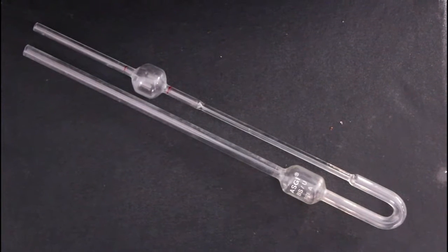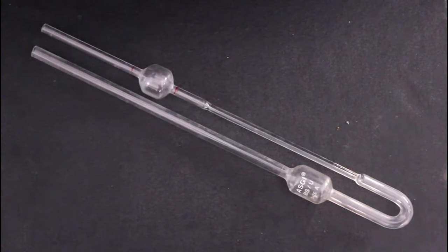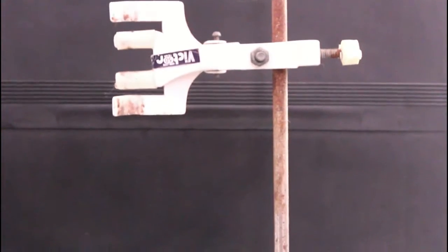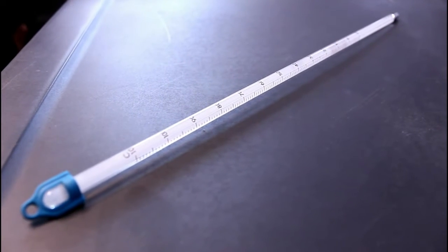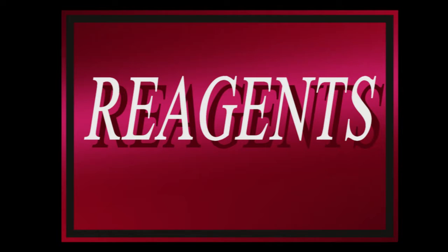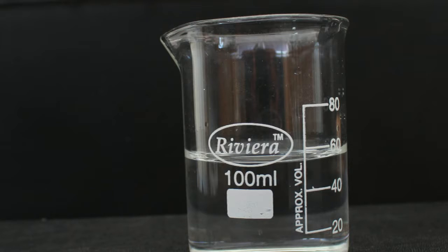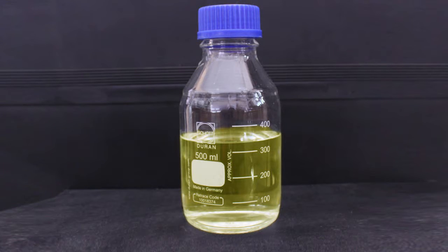Apparatus: Ostwald viscometer with viscosity range from 1 to 3 centipoise. Stands with clamps to fix the viscometer. Thermometer with graduation of 1.0 degrees Celsius. Stopwatch. Pipette, 10 or 25 milliliters. Reagents: milk of cow and buffalo, distilled water, sodium hydroxide, chromic acid.